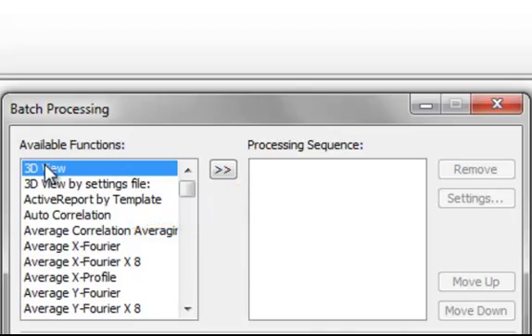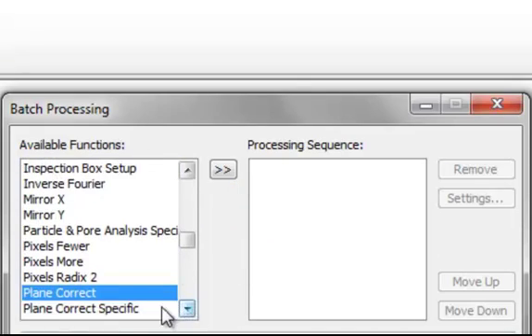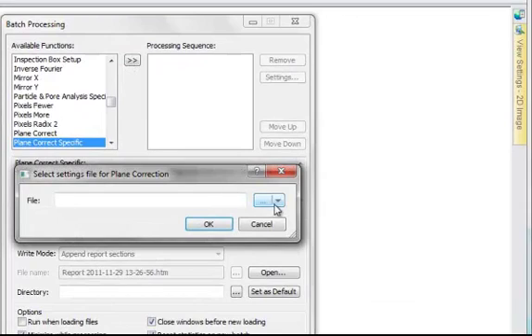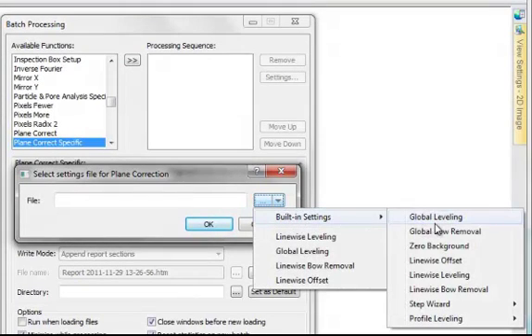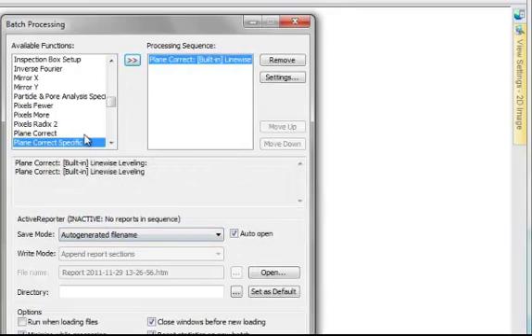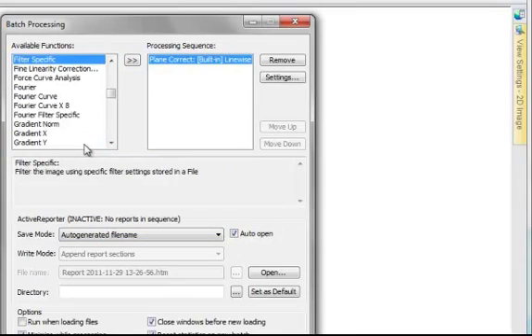First, we want to add a plain correction in the form of a linewise leveling. Next, we want to add a specific filter, that is, the 2 micrometer L filter.